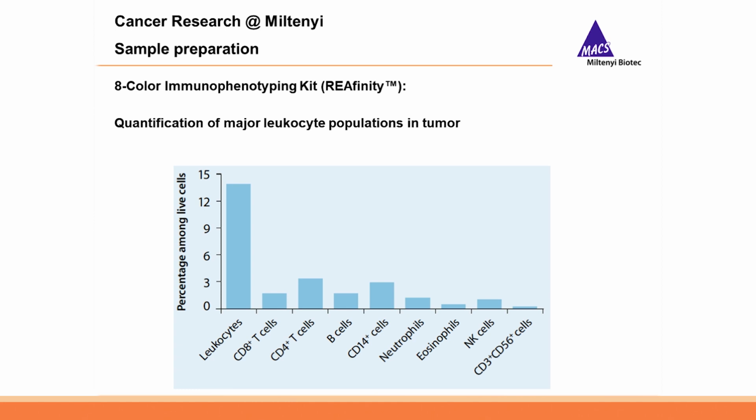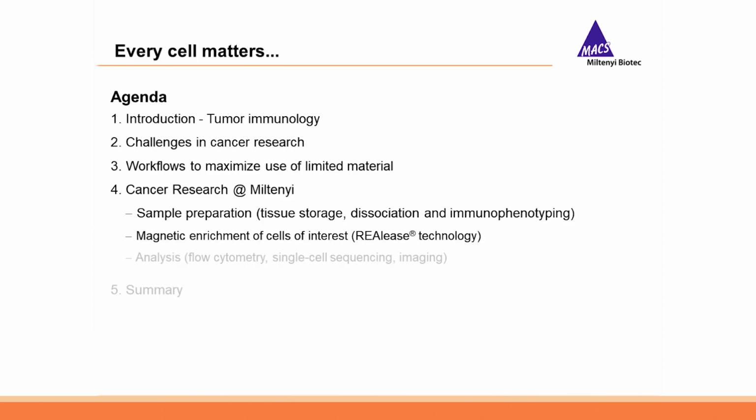We can then quantify the frequency of the major leukocyte populations in the tumor, and it becomes quite obvious that the frequencies of each of the individual populations are quite low. Because these cells are so often found in low frequencies, we developed new reagents for the magnetic isolation of T cells specifically from the tumor based on the new REAlease technology.